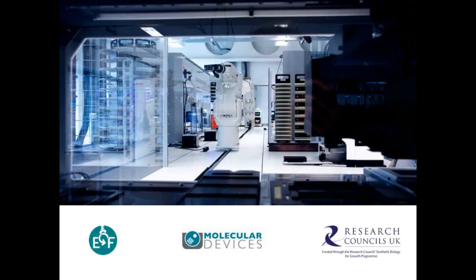We will put special emphasis on our customized QPix Select HT colony picker and spreader from Molecular Devices that you can see here in the foreground. A crucial step in DNA assembly is the amplification of DNA in bacteria or yeast. The QPix can plate out these cells on agar dishes and the next day pick individual colonies for growth. The QPix is integrated into our robotic platform, and we will describe the process in more detail. Before, let me just briefly present synthetic biology and why this field needs platforms like the Edinburgh Genome Foundry.